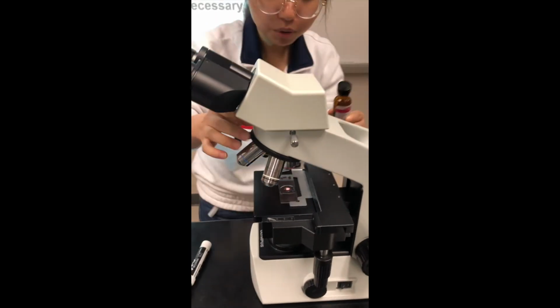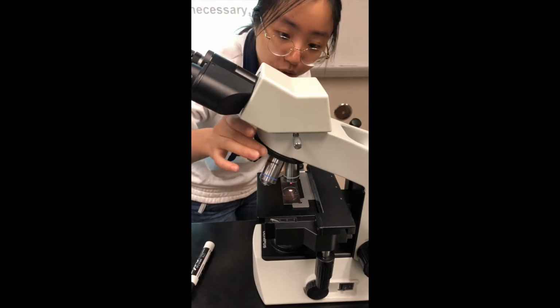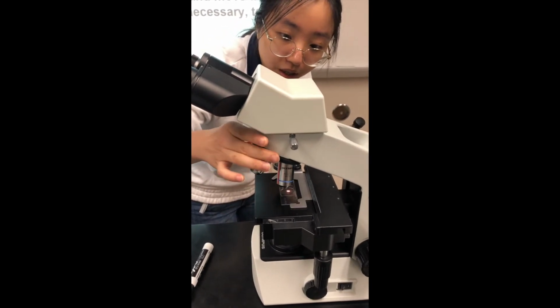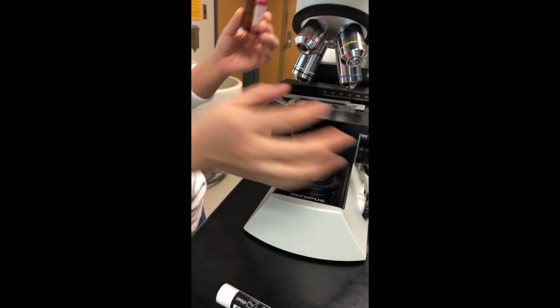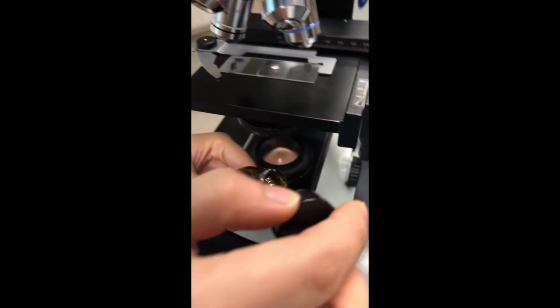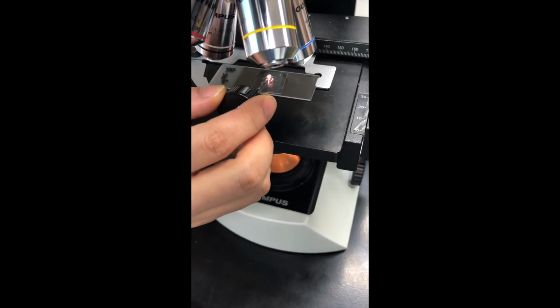So when you want to add oil, what you want to do is place your nose piece, the 2 objective lenses, like this to give you a space. So you could add 1 drop of oil, probably 2, but here 1 seems to be enough.